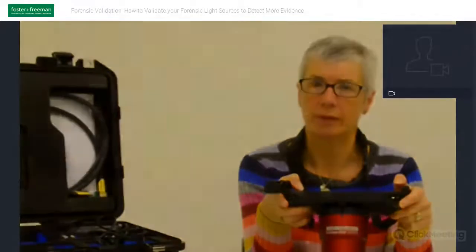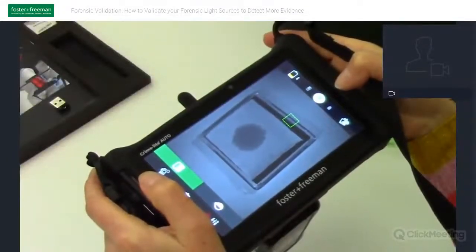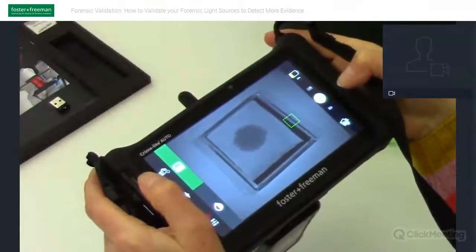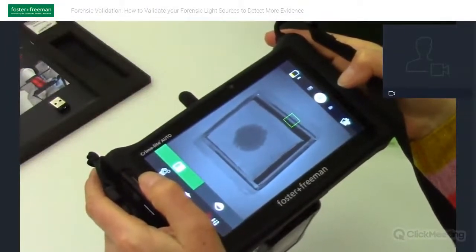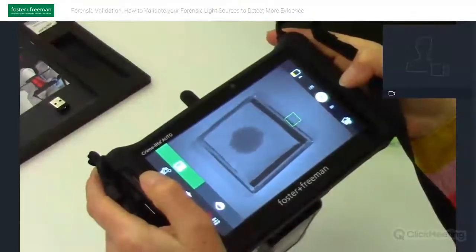The difficulties of searching dark casework items for blood are well documented. Typical searching methods can be time-consuming and may result in potentially important blood stains being missed. Using reflected infrared, we can clearly see the blood, which enables the examiner to interpret the pattern and also select the most appropriate areas for presumptive testing and DNA analysis.